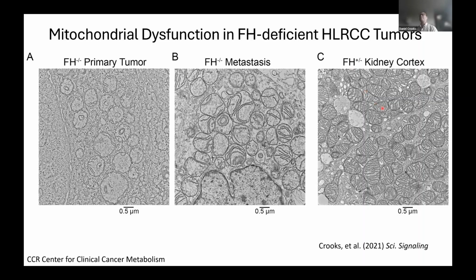We see mitochondria with really nicely packed cristae, abundant mitochondria, nice double membrane. Multiple cells are in this plane of view. Going over to the left, in a primary tumor, the staining isn't so great, but what you can see is mitochondrial structures, but the cristae are really malformed or absent. There's a little bit of an onion-shaped structure forming in some of these mitochondria.